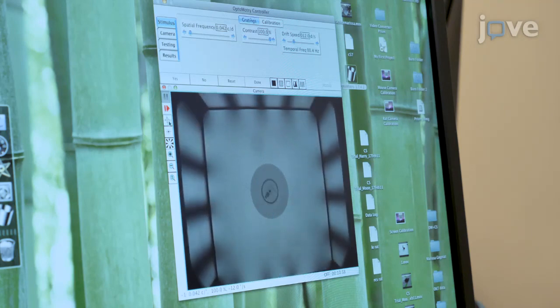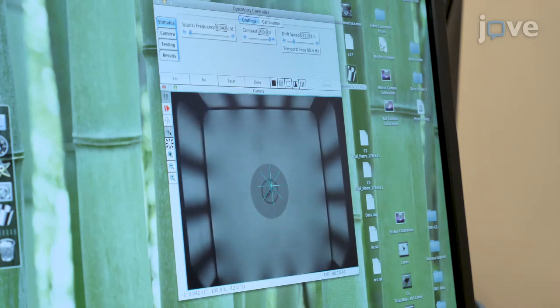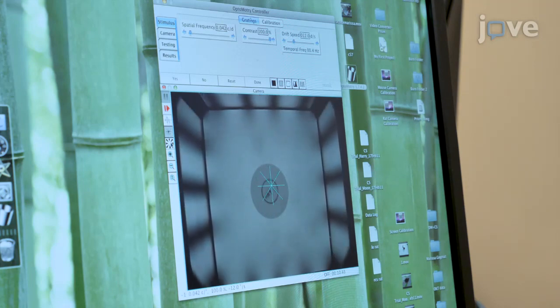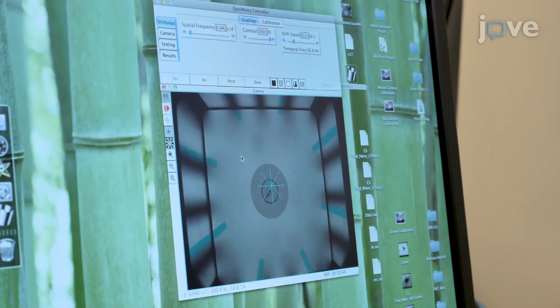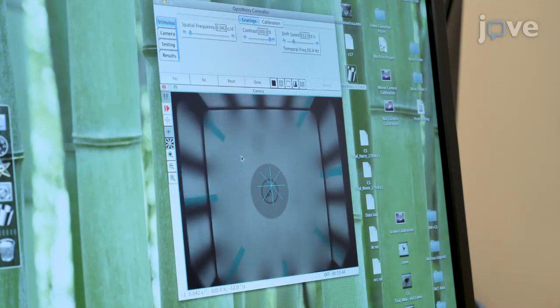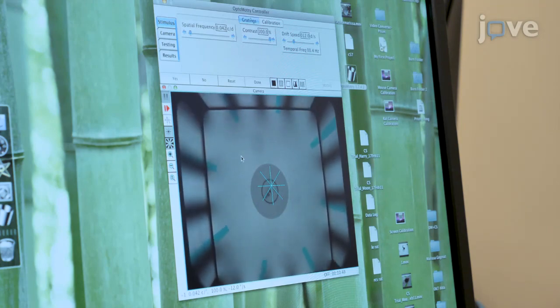When the OMR is completely aligned, re-click the compass, asterisk, and rotating stripes icons. Note that the green stripes will rotate in the same direction as the stripes in the drum.